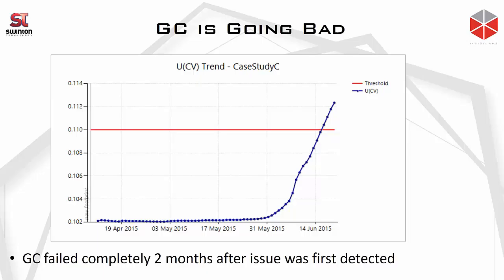When we talk about uncertainty budgets, a lot of times people use 0.3% CV uncertainty in the uncertainty budget of their GC. When you see this particular data, you can tell that the GC can perform much better than what we thought using the uncertainty budget that we normally use.